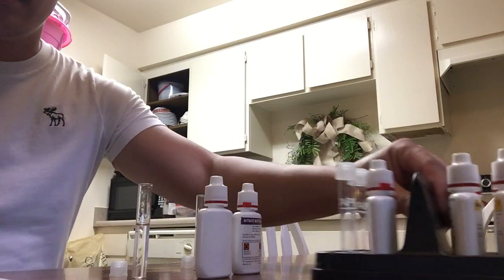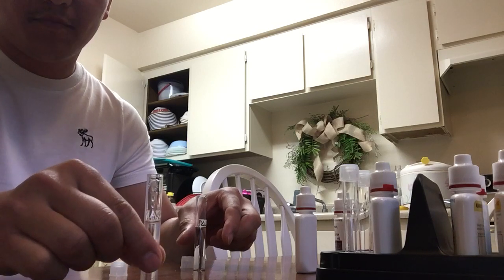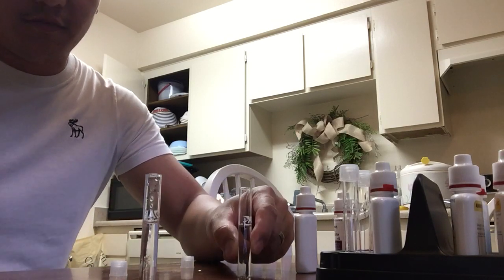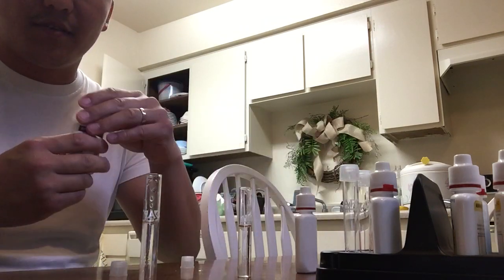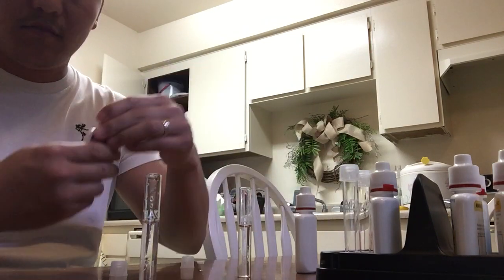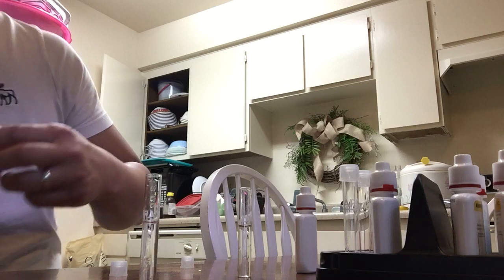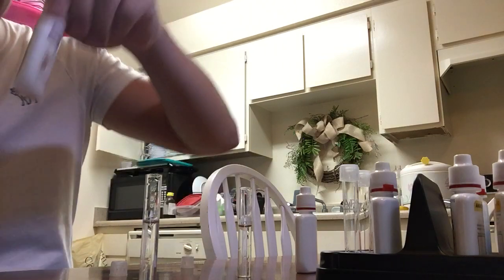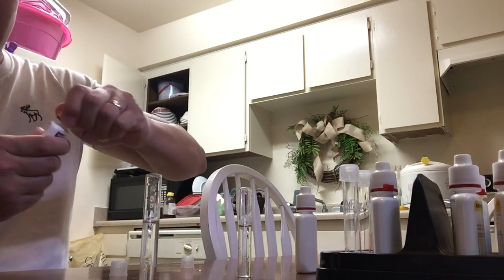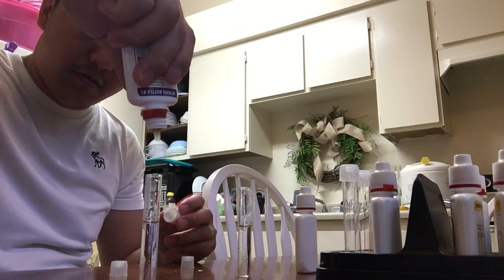Remember, this one is from the tap, this one is from the filter. And we'll do the test. Bottle one — 10 drops.